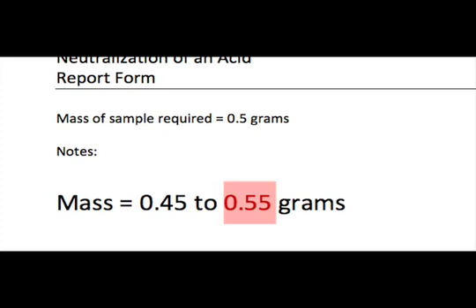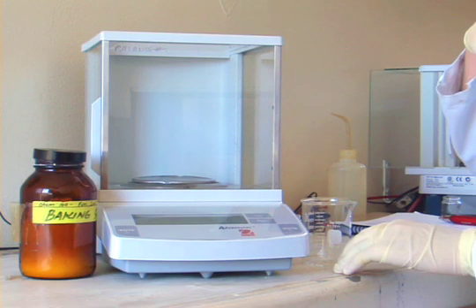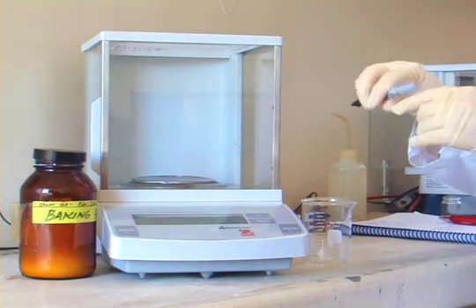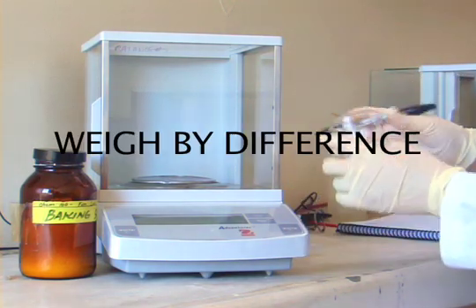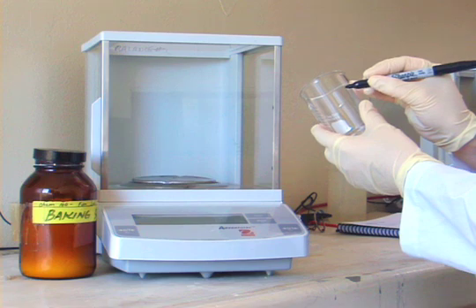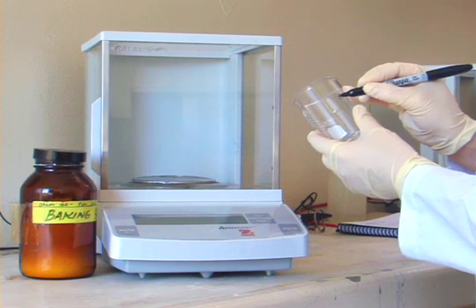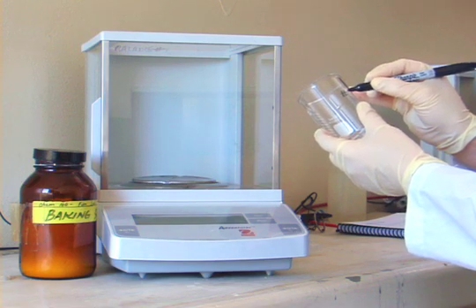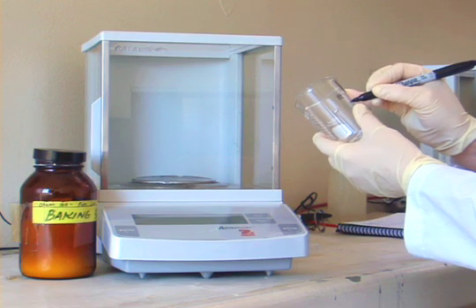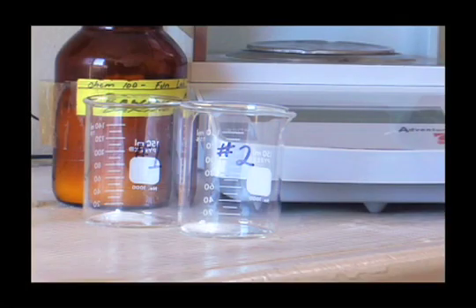A little over or under is also acceptable. To measure small amounts of solid accurately, we use a method called weigh by difference. Since our experiment requires two different samples, each in its own 150 ml beaker, we will number the beakers to make sure our samples do not get mixed up.